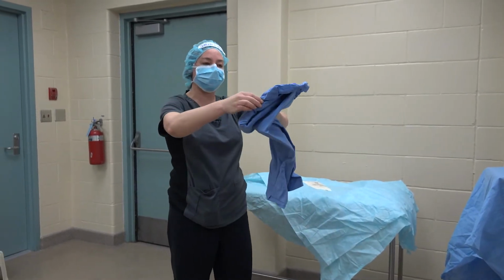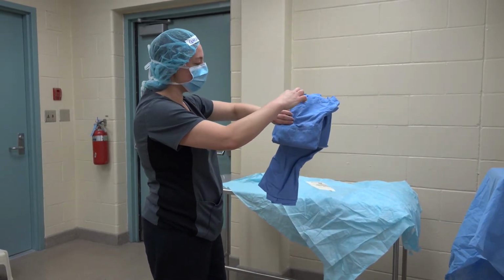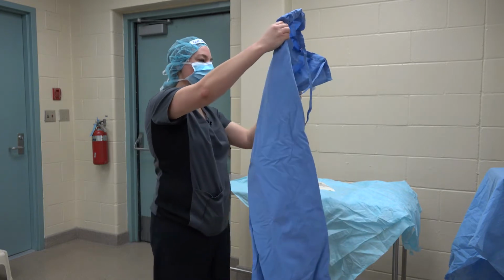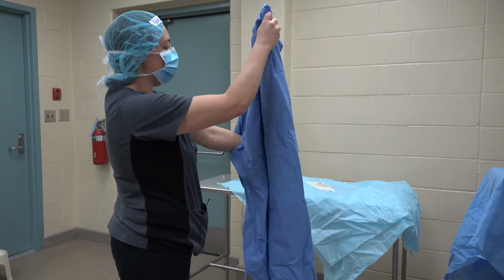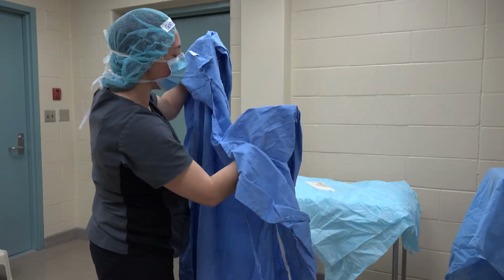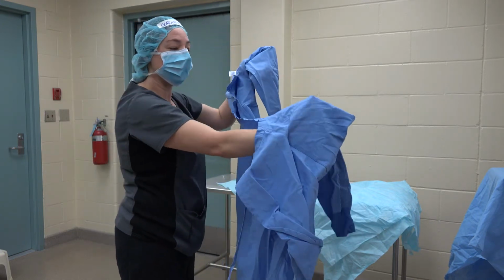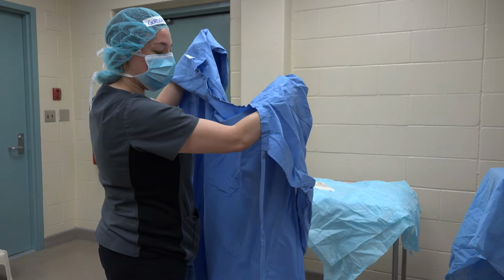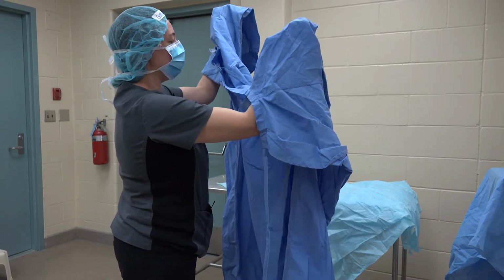So now I have my gown, and it's wrapped so that the collar is up here towards the top. I'm going to grab it by its armpits. So now I have it by its armpits like this, okay? And I'm going to stick my hands into the armpits. If you see, I am being super careful as to where I am in space because I do not want any of these sleeves to hit a table, our other table. I don't want anything to get below my waist, so everything's above my waist.